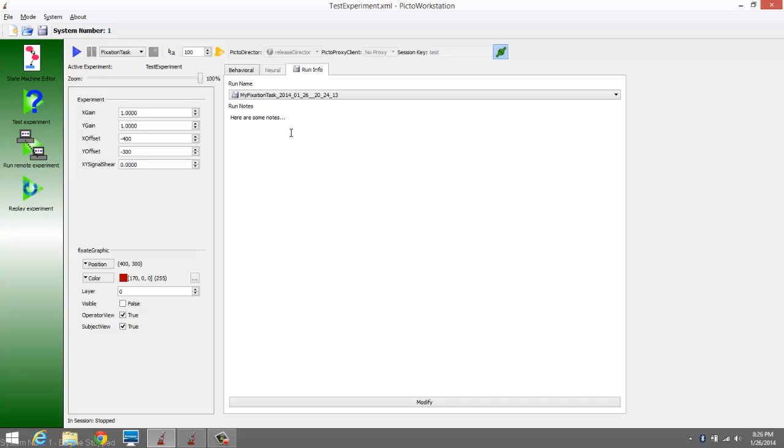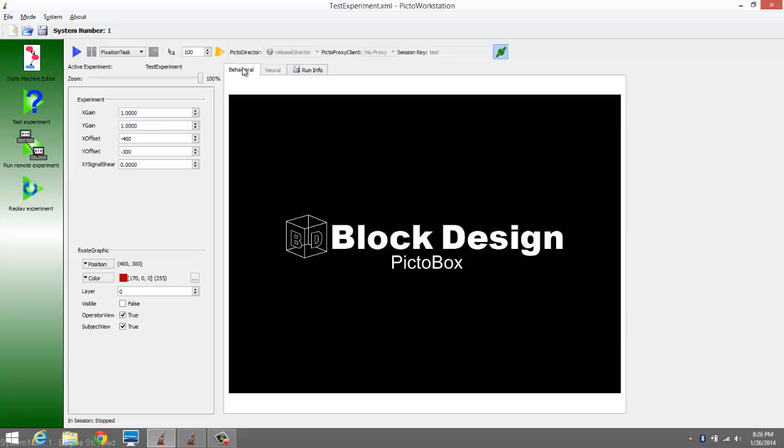And if you have multiple workstations viewing the same experiment, the same session at the same time, these notes are going to automatically be propagated to all the workstations. Everything is sort of cloud synchronized, you might say. So that's that. And now let's finish up the session.